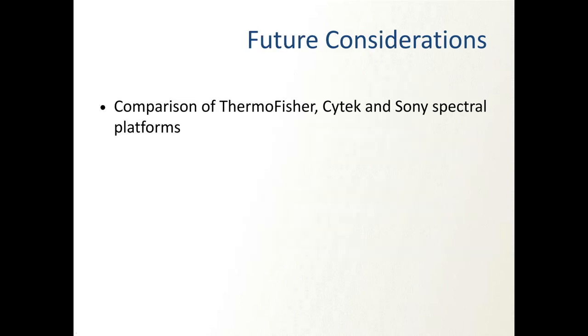But future considerations are big. And this is where we're at right now. And I think this is where the next great drive in flow will be: comparison of these different spectral platforms. Because for a while, it was all defined by Cytek with their Aurora, and that thing delivered amazingly. But now we have the Bigfoot. And now Sony has their new ID system, which is a super high dimensional spectral system.